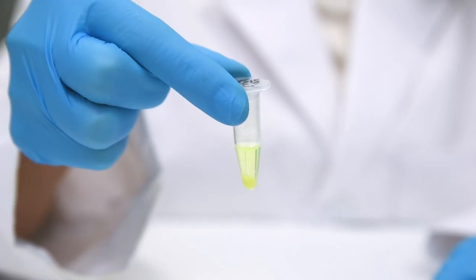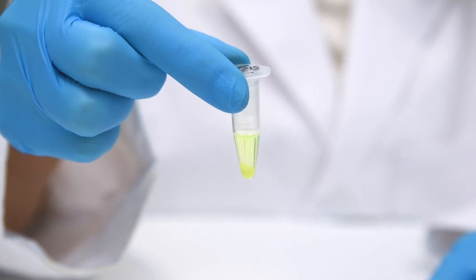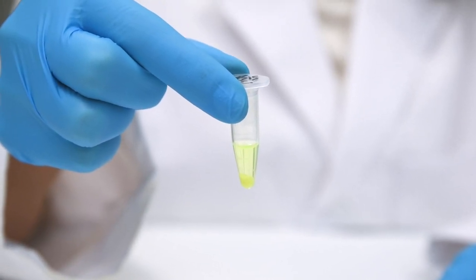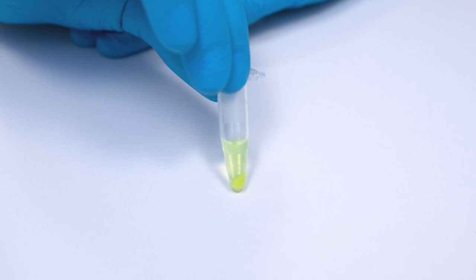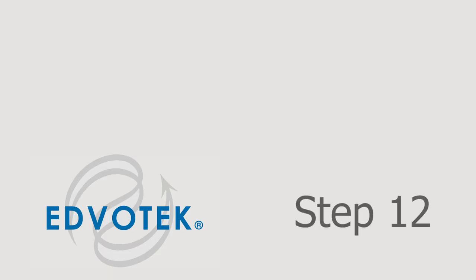Step 11: At this point the supernatant should contain the green fluorescent protein. If the supernatant is not fluorescent or if the cell pellet is fluorescent, repeat the freezing, thawing, and centrifugation steps until the GFP is released into the supernatant.